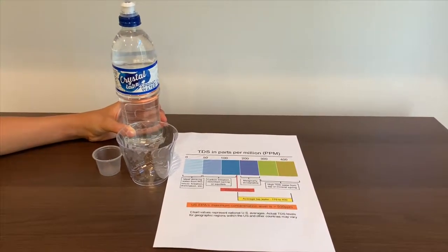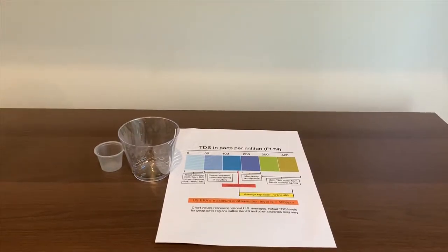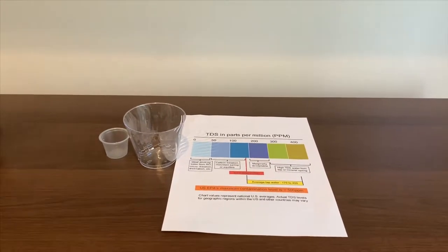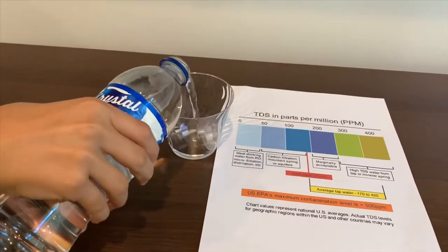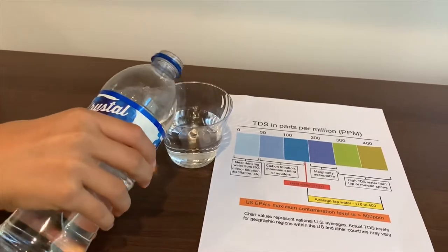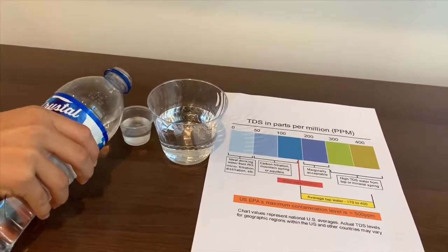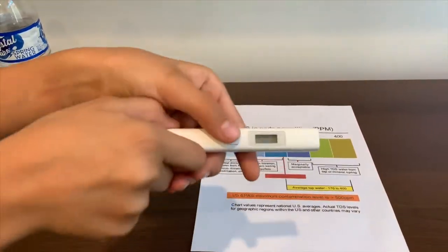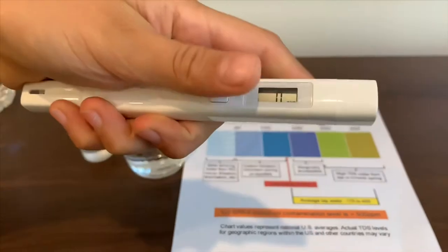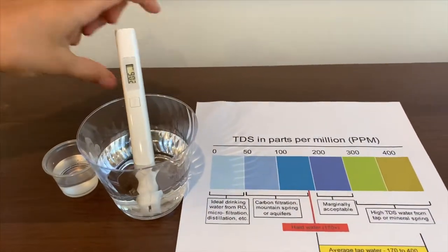First we're going to test the TDS level, then the pH. Let's pour some water in. Let's turn on the TDS and make sure it says zero. Put it in and let's wait.